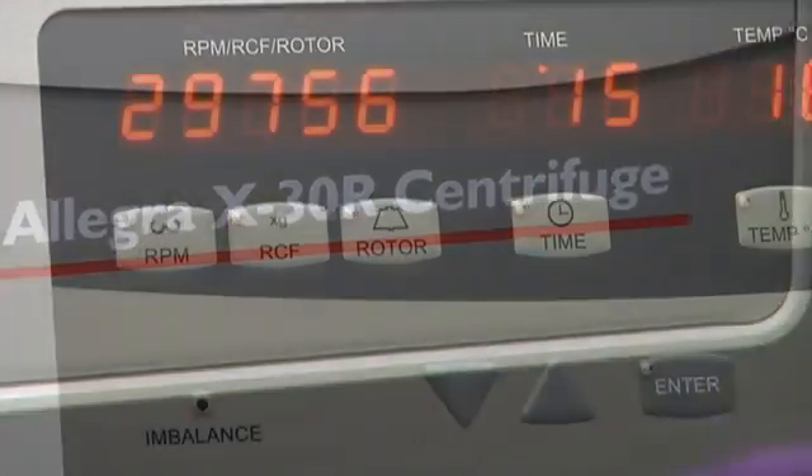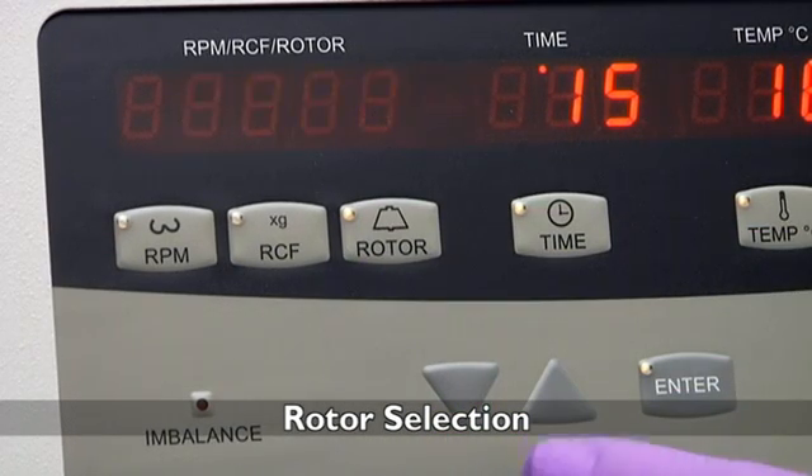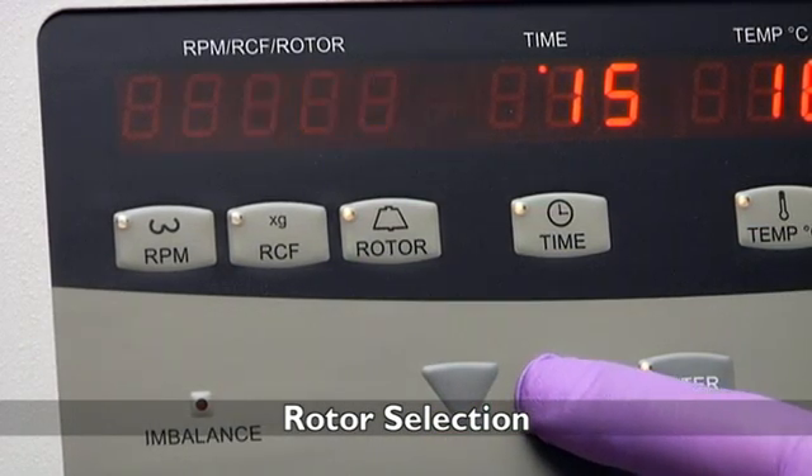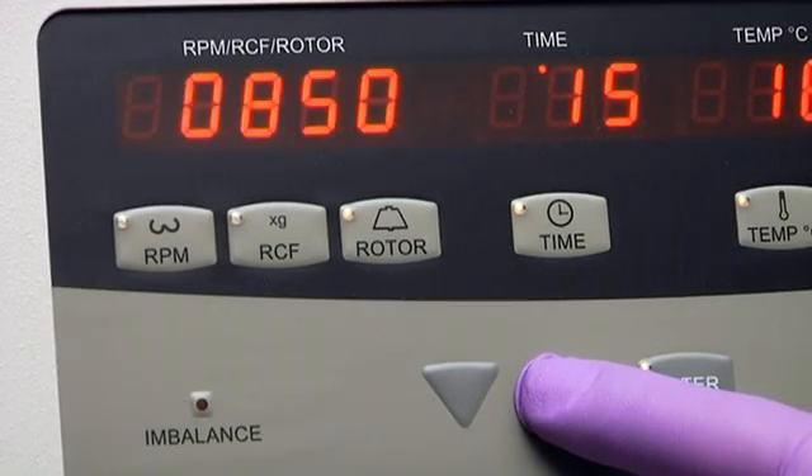The Allegra X30 features an internal library of 13 rotors which you can select from. For safe operation, the Allegra X30 will only begin a run if the proper rotor and parameters have been selected.